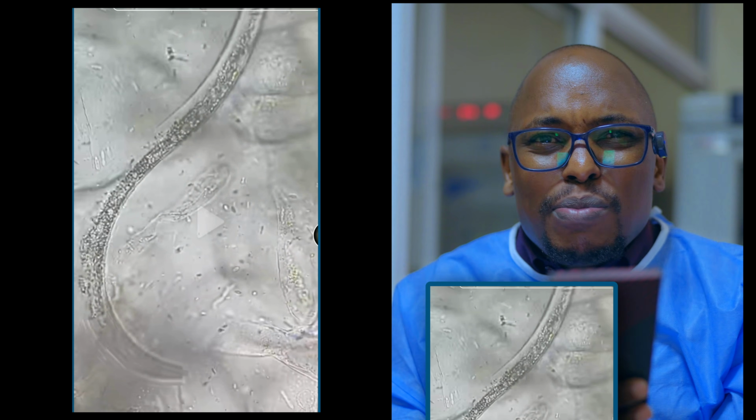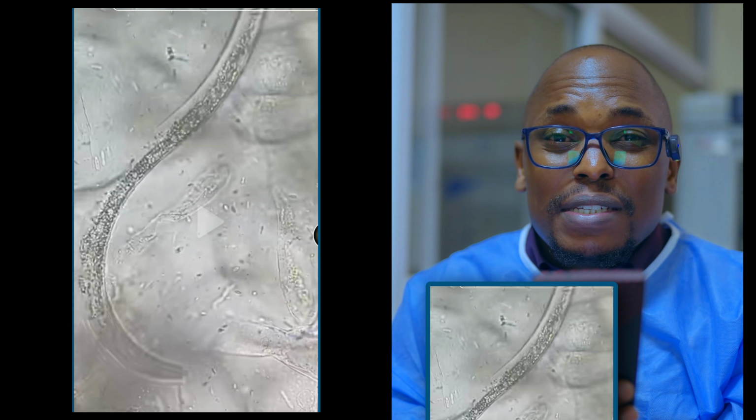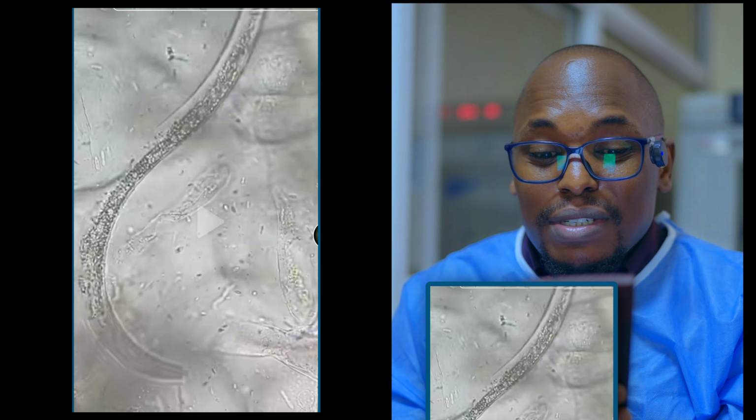Well, it might be possible because it's rotten for a reason. It's rotten because maybe it's fermenting or maybe you have some organisms in there, but it's hard to tell.